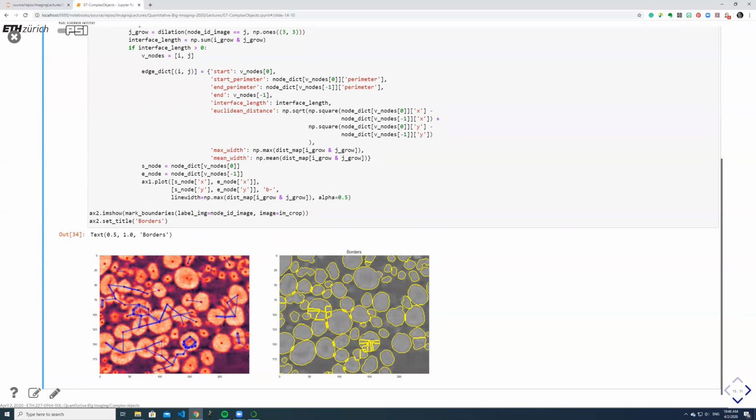But the real sample is actually 3-dimensional, and when you start doing the watershed segmentation and graph analysis of the 3-dimensional, I would expect that we have a much greater connectivity than the histogram shows on the other slide. So all these items are probably connecting with each other, even though they're not showing it in this particular image.